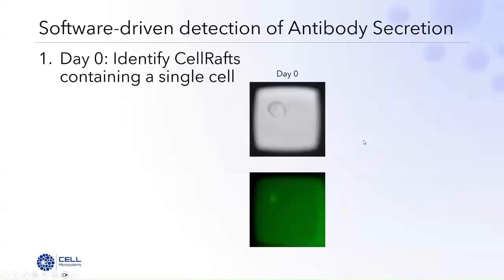Now, that one lone raft sitting in that field of view is great, but as most of you are probably thinking to yourselves, that's one raft in the sea. How on earth do I find that raft in order to recover it and expand it? And this is where the software comes in.